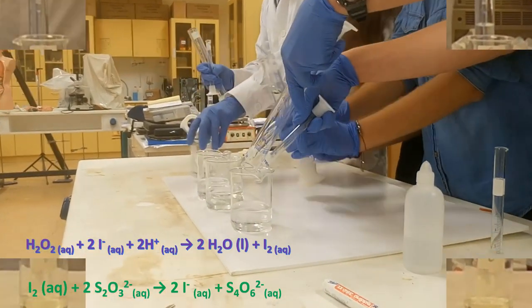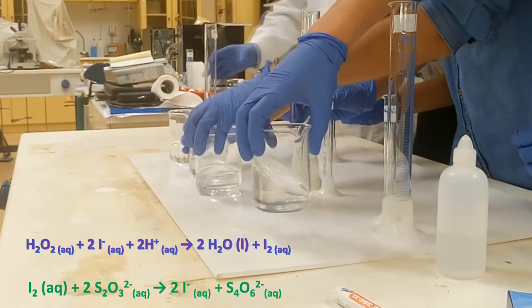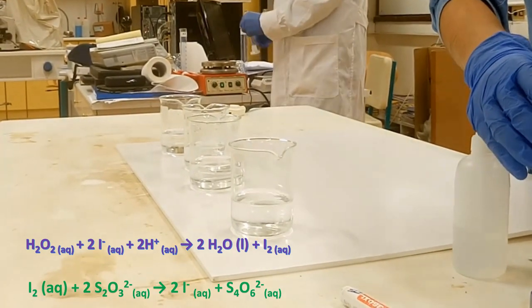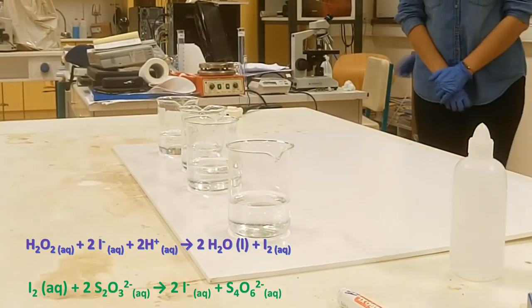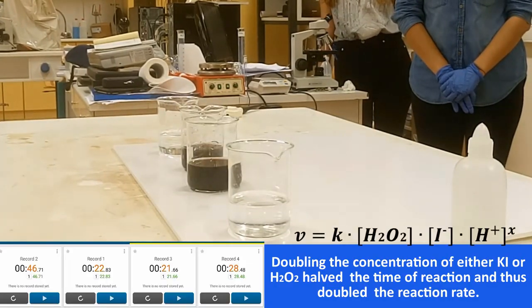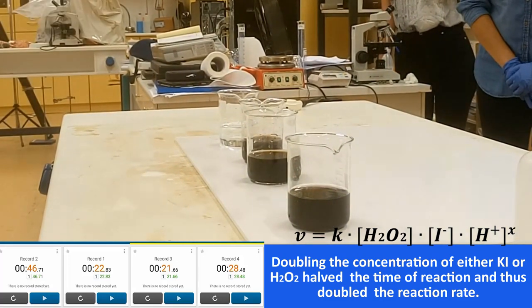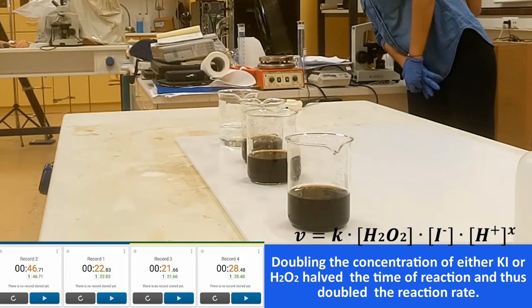Two reactions take place at the same time. In the first reaction, hydrogen peroxide and iodide ions produce elemental iodine, which is rapidly consumed by thiosulfate in the second reaction. Since thiosulfate is in deficit, as soon as it is exhausted, iodine stains the starch instantaneously with a deep blue color. In all four beakers, this happens when a specific amount of iodine is produced independently of the initial concentrations. The rate is directly proportional to iodide or peroxide concentrations, thus part of rate law equation is derived.